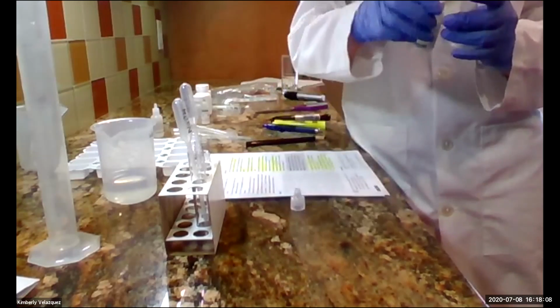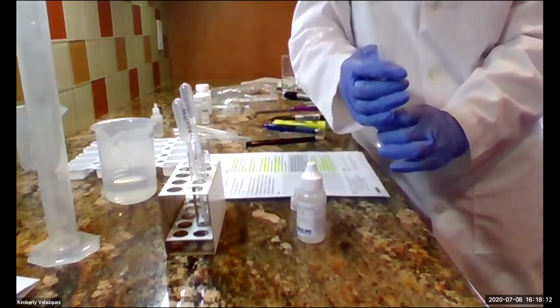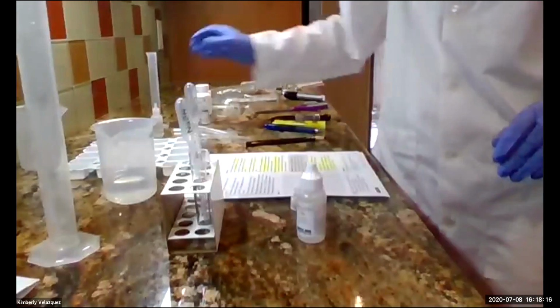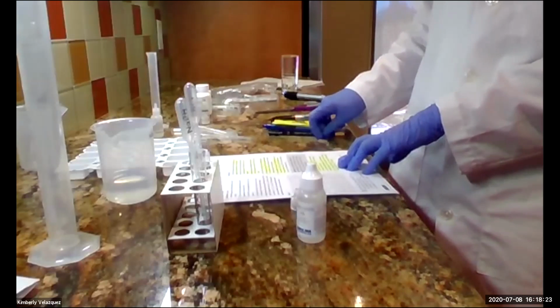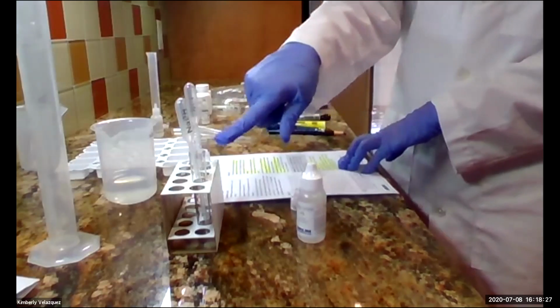I'm going to add 1.2 mils of that to my graduated cylinder, and then I'm going to add enough water to get me to 12 mils, and I'm going to pour that into the sodium hydroxide test tube. Okay, now what I want to do is add pH indicator to both of my test tubes.